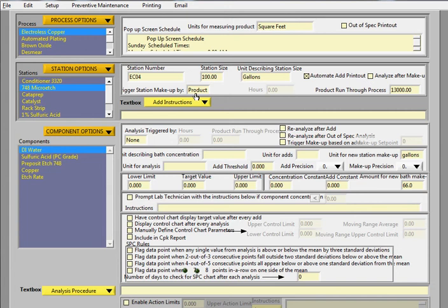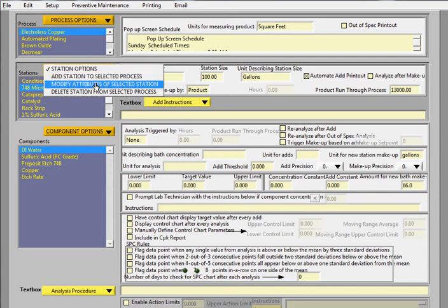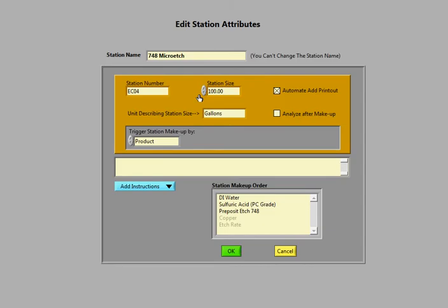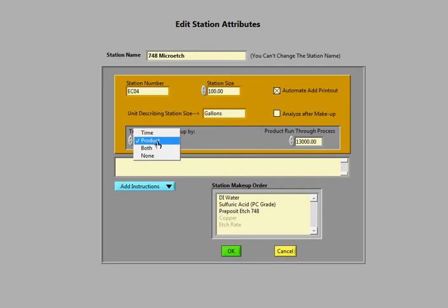You can trigger the station makeup by two methods. One is by product going through the process. And you can see that here.